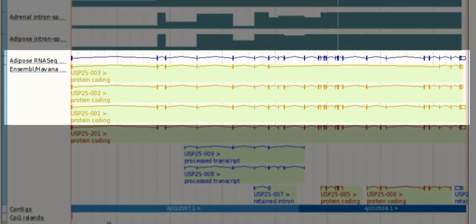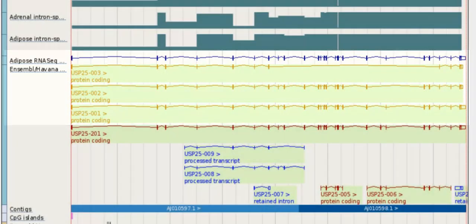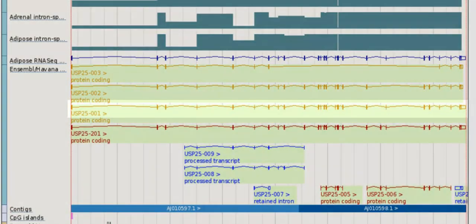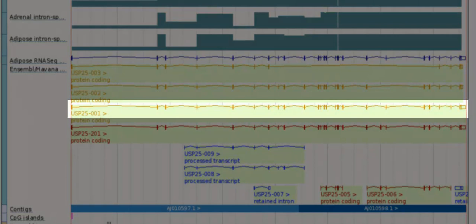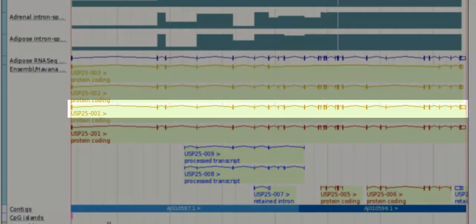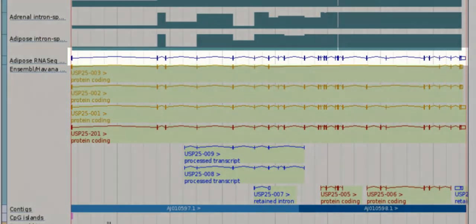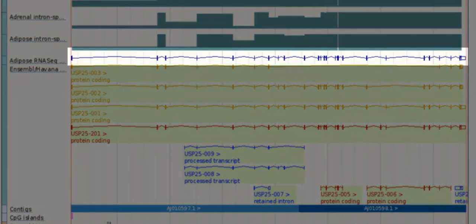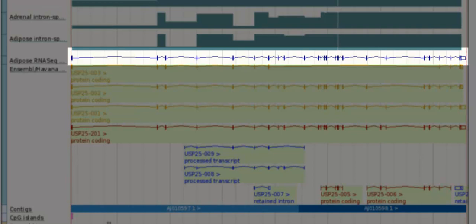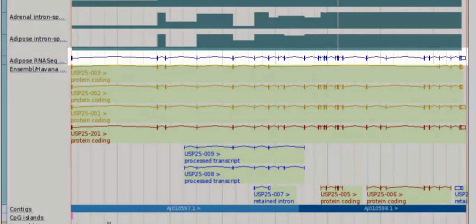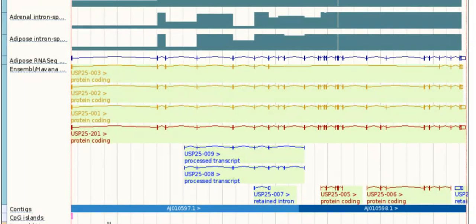The adipose RNA-Seq gene model matches the exon structure of a gold transcript, USP25001. Gold transcripts are a high-confidence set, where manual annotation from the Havana project matches to what comes out of the Ensemble Automatic Annotation Pipeline. The RNA-Seq here supports the hypothesis that the USP25001 splice variant is expressed in adipose tissue.